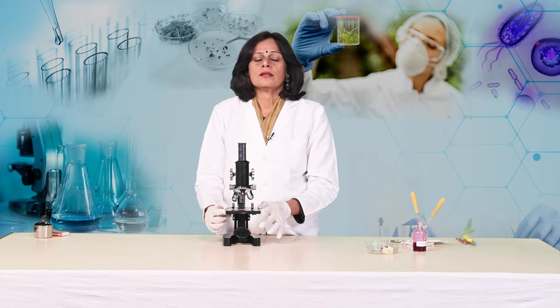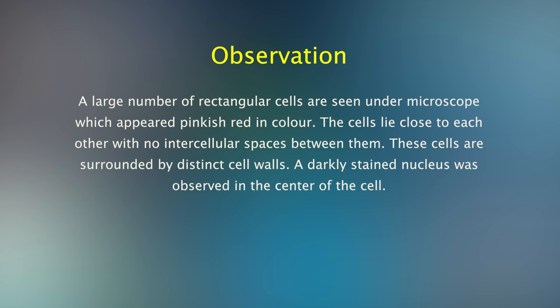We are going to take the following observations. First, a large number of rectangular cells are seen under microscope which appear pinkish red in colour. The cells lie close to each other with no intercellular spaces between them. These cells are surrounded by distinct cell walls. A darkly stained nucleus was observed in the centre of the cell.